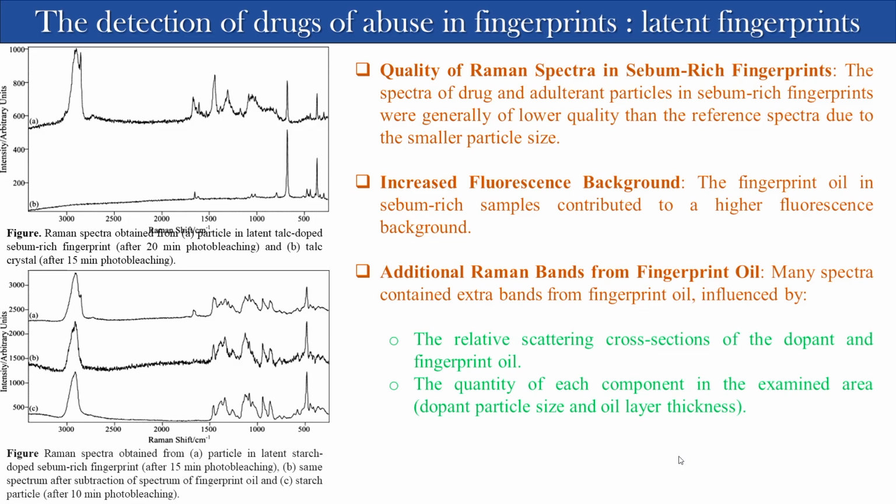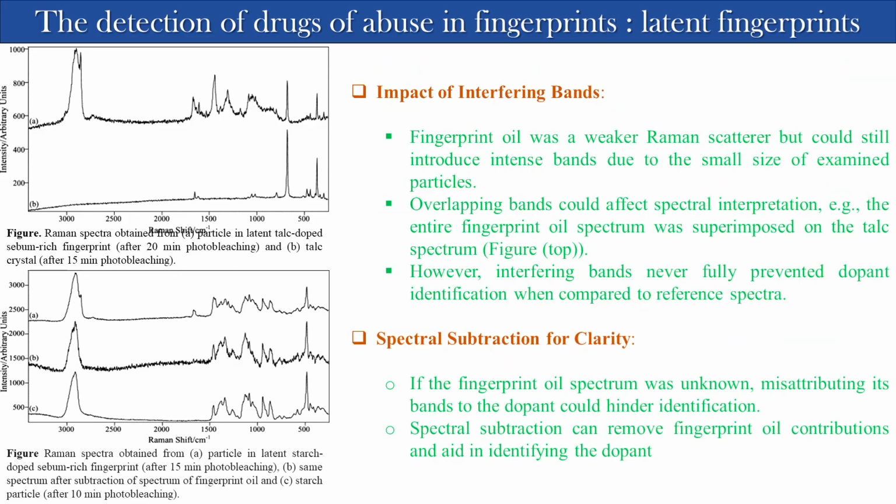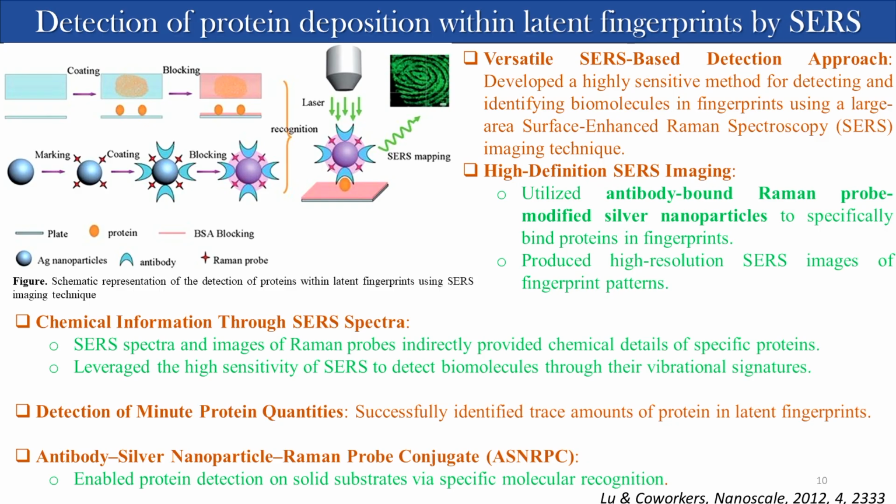For correction also, there are many people doing just correction of the sample, correction of the background. Last, I think 2 years back, I went to a Raman conference. There was a section in which three groups presented, and all three groups presented on how to analyze the Raman spectrum, how to get a corrected Raman spectrum from uncorrected raw data.